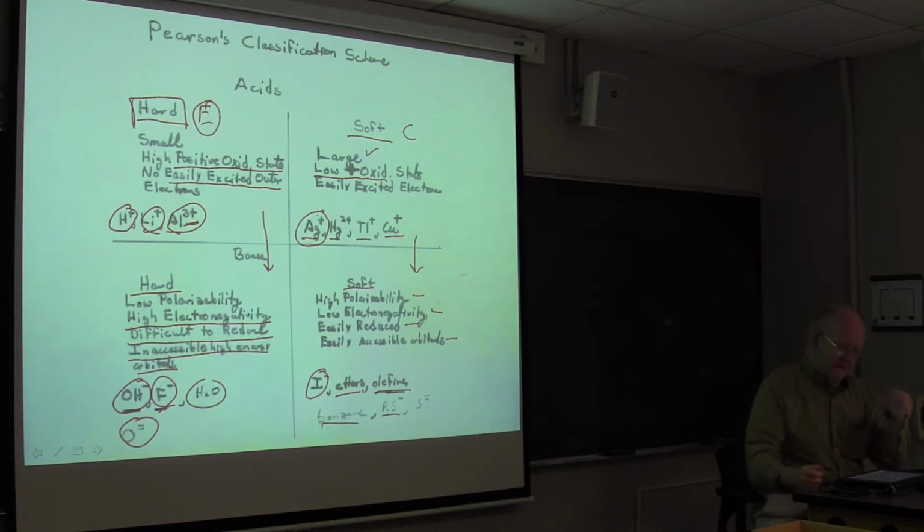A couple of years ago, I read a really excellent paper by some people in food science who wanted to separate different kinds of carotenoids from non-carotenoid molecules. Well, carotenoids, I may be misremembering, but it's like 30 carbons long, and it's double bond, single bond, double bond, single bond, double bond, single bond, and so on. It's hyperconjugated, and the silver impregnated normal phase just sucked the stuff up and gave a gorgeous separation of the carotenoids from almost everything else in the mixture. It's just chromatographic applications of this kind of chemistry.